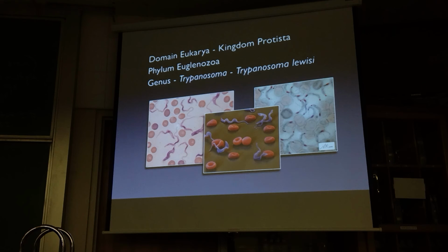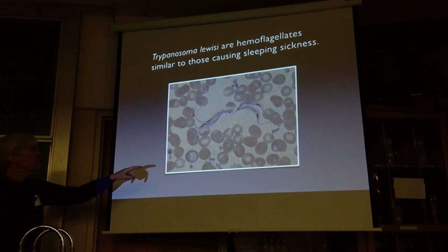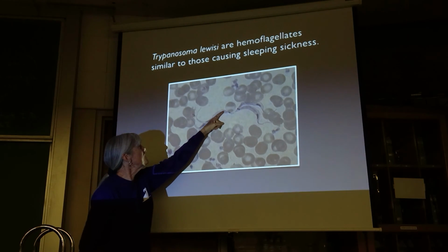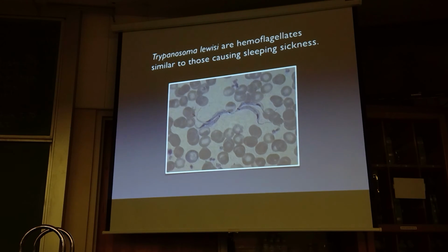It's kind of hard to see this, but you might be able to actually see it if you look closely. So here we see a trypanosome gathering. The trypanosomes have their pigment spot at one end, but notice this kind of wavy surface there. I believe that image was taken with a 100x objective, but you can actually see that kind of fin-like thing with the flagellum enclosed in a double layer of membrane, and then it comes off the end. So those are trypanosomes. Again, they're between the blood cells. Leishmania cells look very much like that. Our slide boxes don't have Leishmania in them.